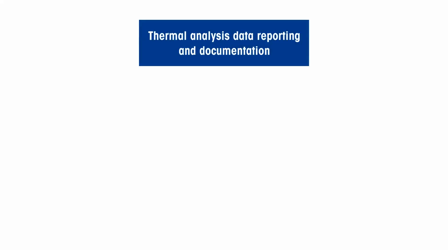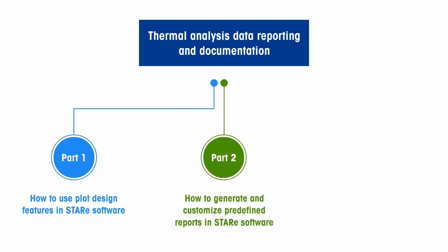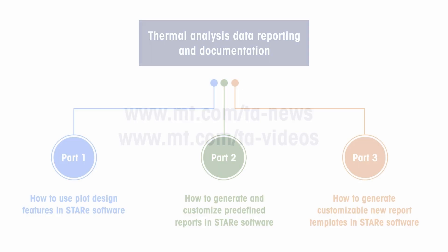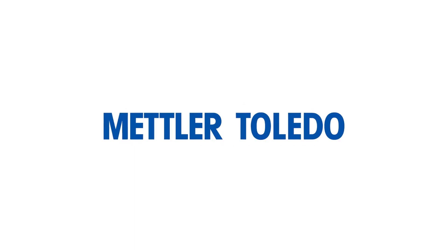This concludes our video on how to present thermal analysis data in a plot using design features in the STAR-E software. The procedures for customizing existing report templates or creating new report templates from scratch are covered in Parts 2 and 3 of this video series. For more thermal analysis related how-to videos, please go to www.mt.com/ta-news or www.mt.com/ta-videos.